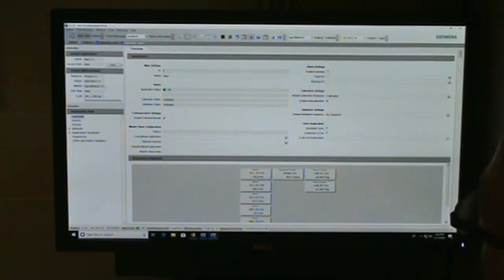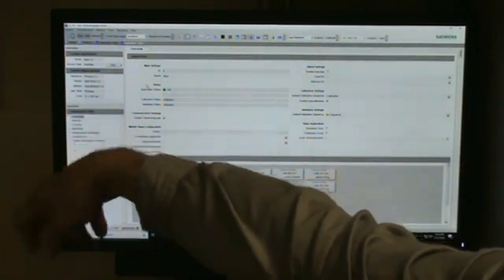Now, what we want to do is we want to just go ahead and run. So we're going to get up here, we're going to say run, go. And you notice our bubbles quit going because of the sample shutoff valve. Of course, you can't see them right now, but trust me, the sample shutoff valve killed our bubbles. And now I'm going to put it in hold because we're going to want to jack with it at the very end.